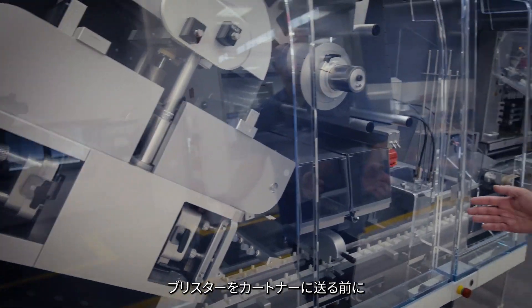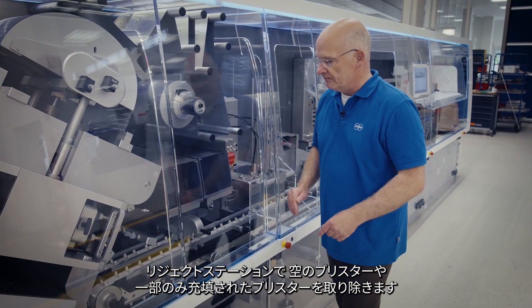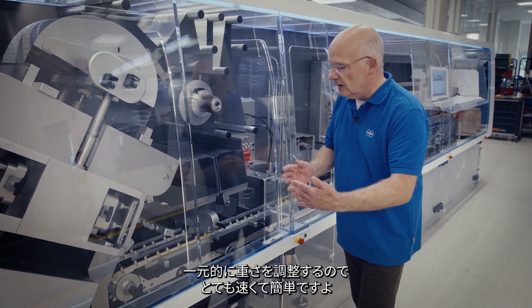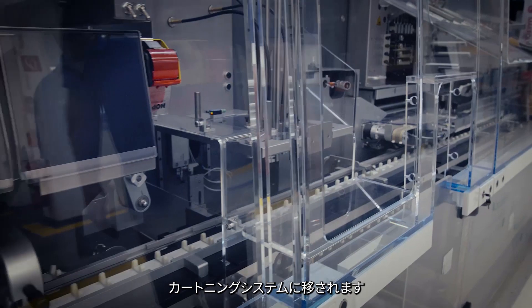Before presenting them over to the cartoner, the reject station can receive completely empty blisters or partially filled blisters. Blisters which are good are placed down into two servo-driven belts, centrally adjustable to different widths — very fast and easy — and are staged into a single lane and transferred over to the cartoning system.